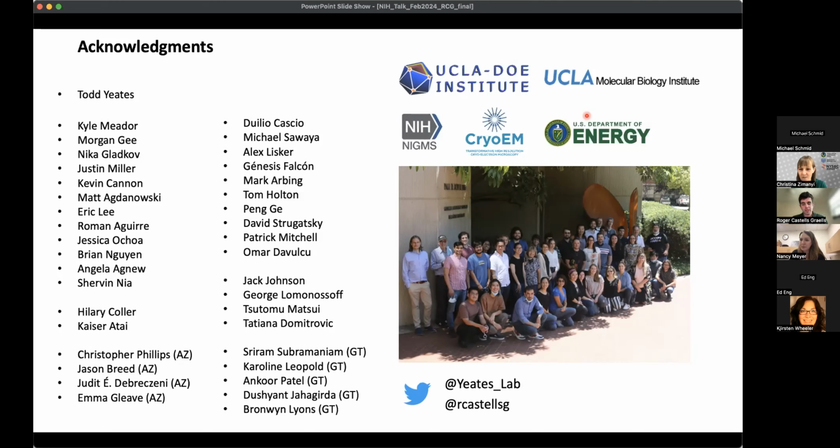we then expressed. For the ones that we expressed, some of them were insoluble. Some others would not assemble properly. So in the end, we ended up with 5 designs that would form protein cages and have the right arrangement. And then we looked for the design that, when we would do cryo-EM on it, would have the highest stability and yield the highest resolution.